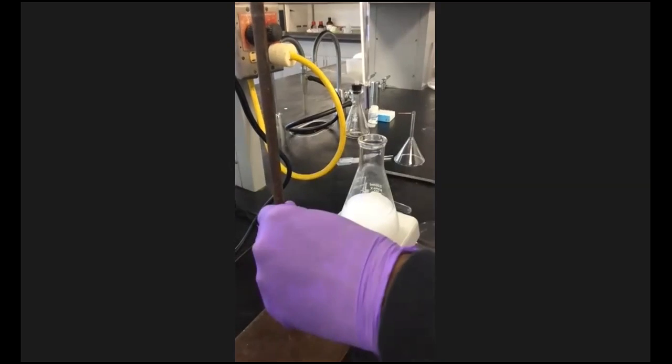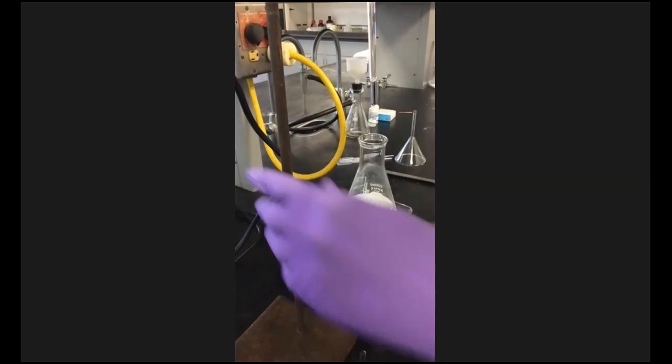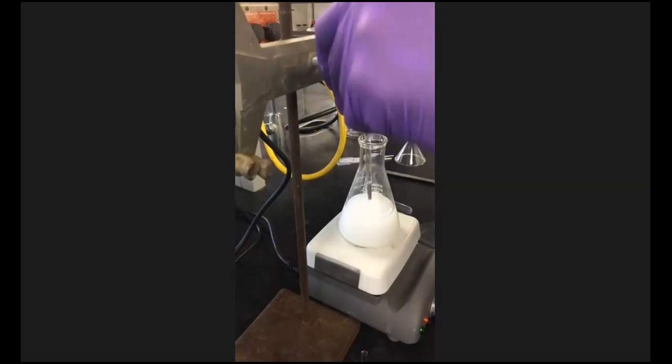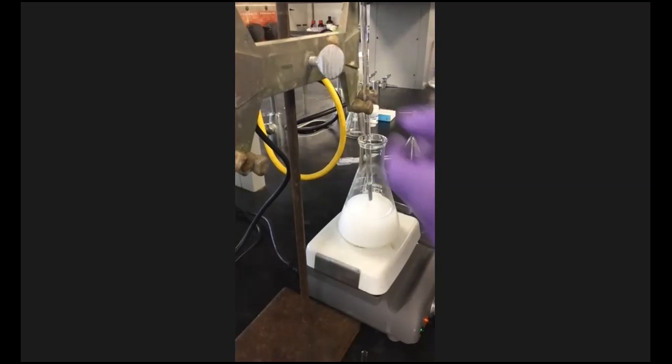And again, you just want it to be gentle heating. You don't want it to boil at all. And you don't want your thermometer to go to the bottom, because if it does, you're gonna get an inaccurate temperature reading.